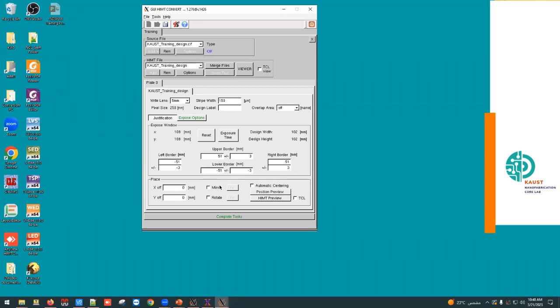We have one more solution, because some users maybe are new to the design software and they don't know exactly how to center. My recommendation then is just create your pattern in a symmetric way. And if your pattern is not symmetric, you can make it symmetric, just putting some alignment marks or, I don't know, just the cow's logo at the same distance.